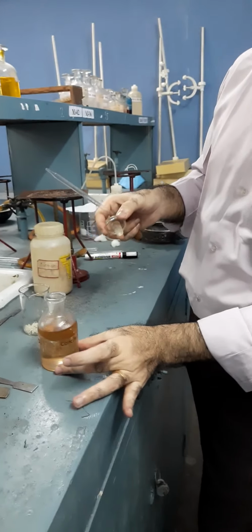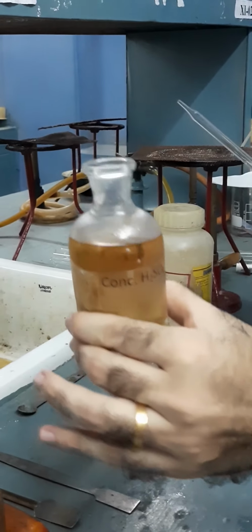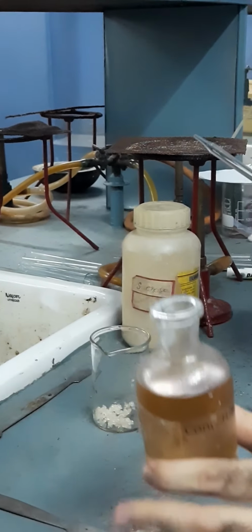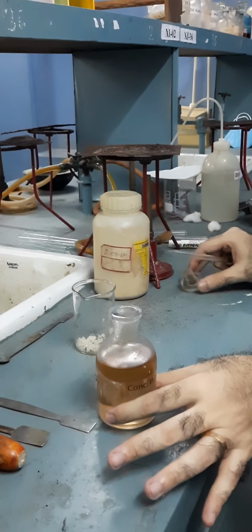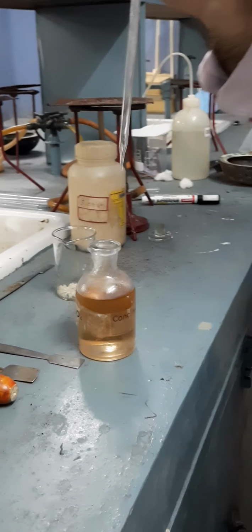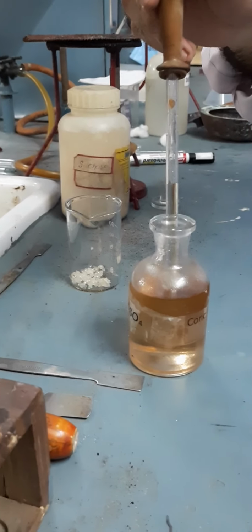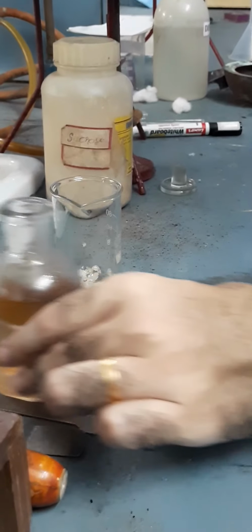So as you can see, I have taken concentrated sulfuric acid, and I am going to add this acid to the sugar. We will see now what happens.